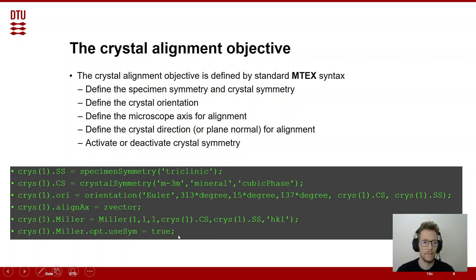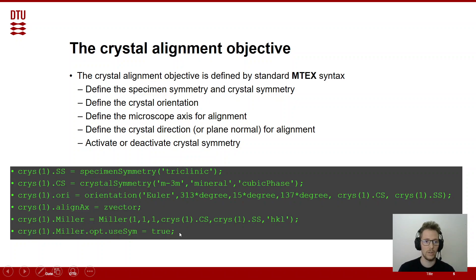That's basically everything we need to define the alignment objective. We can define up to two alignment objectives — aligning three directions with three microscope axes does not make sense, because with two directions we already have the full positioning of the crystal defined.